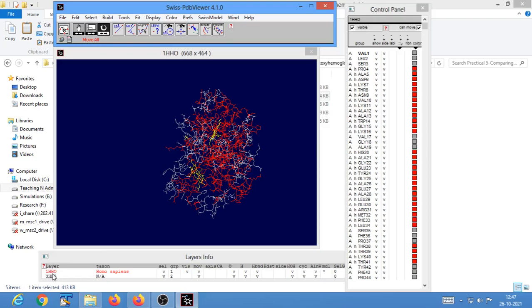So if you want to work on another layer through these menu commands, you would have to make the respective layer active. There is another way to handle this situation. You can hold down the Shift key and then pull down any of the menus.